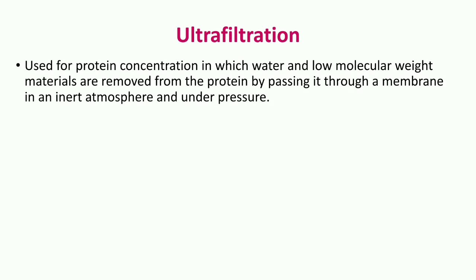The next technique is ultrafiltration. The ultrafiltration technique is used for protein concentration, in which water or low molecular weight material are removed from the protein by passing it through a membrane in an inert atmosphere and under pressure.